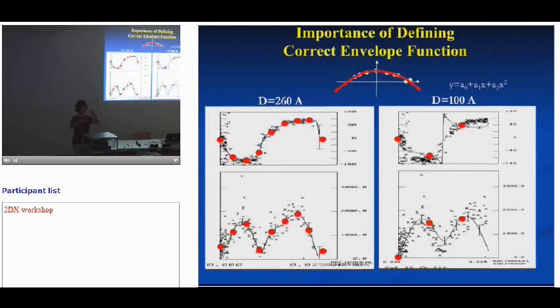So it's like 2 bilayers. So basically, it's a 2-layer of a protein. You get the 2 sets of transmembrane proteins in there. In the practicals you will see this set of data, the map.